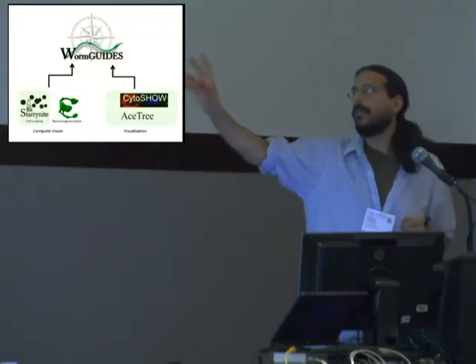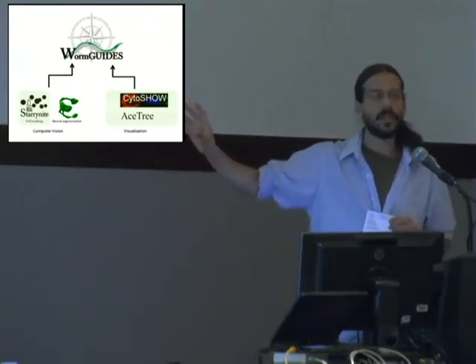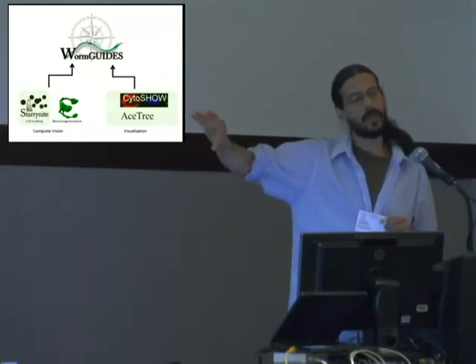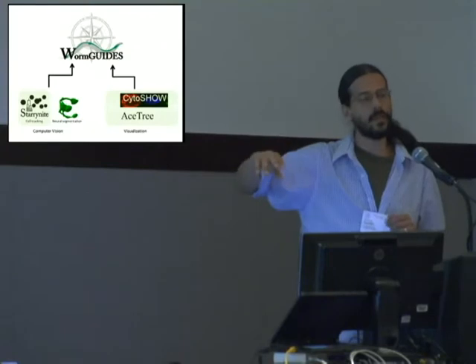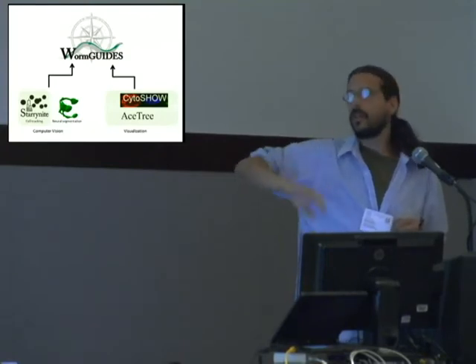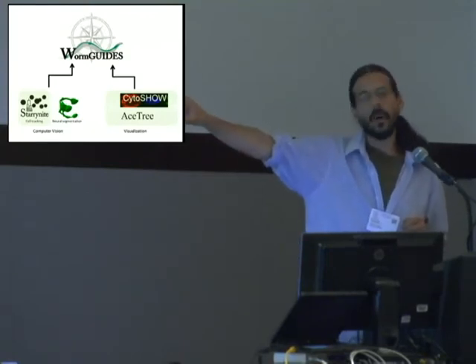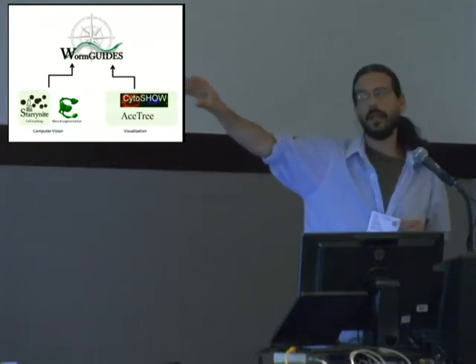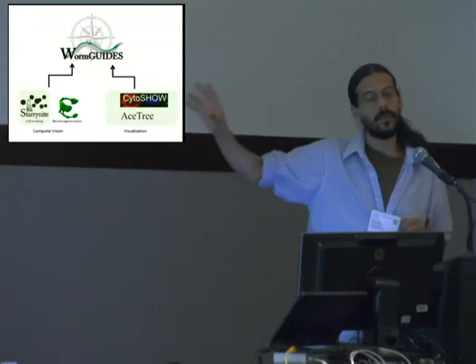So there's a bunch of moving parts in this project, and I want to start by talking about some of the open source projects in the different contributing labs that are becoming part of WormGUIDES before going on to the big vision for WormGUIDES itself and what we've done already.